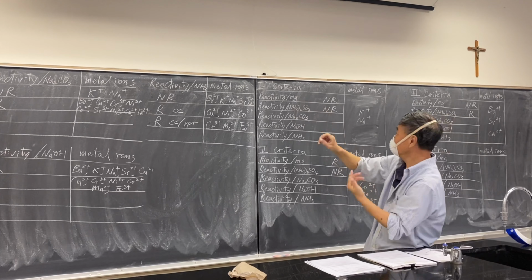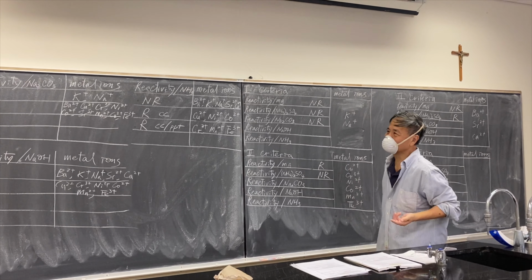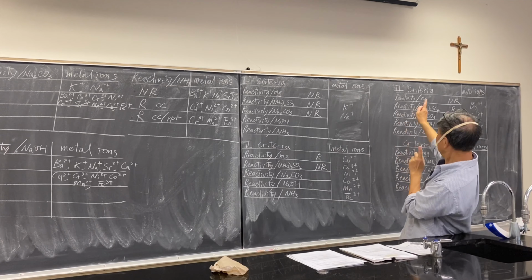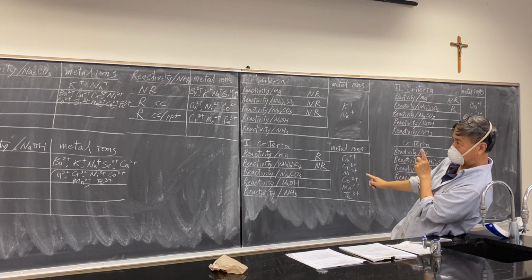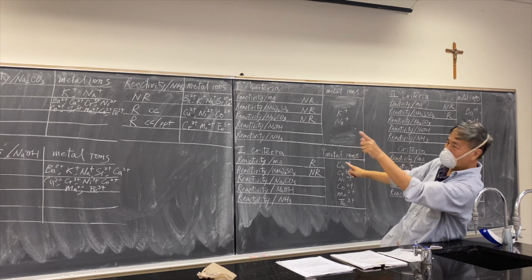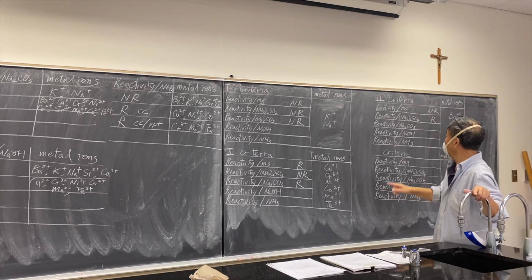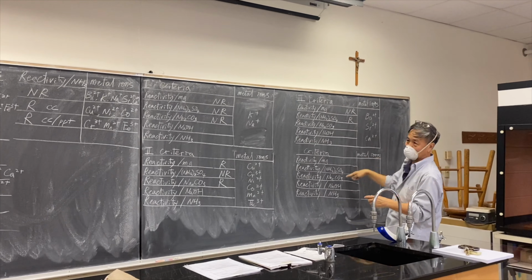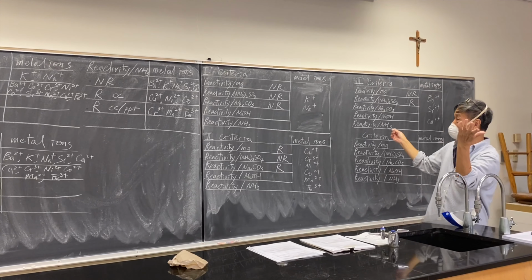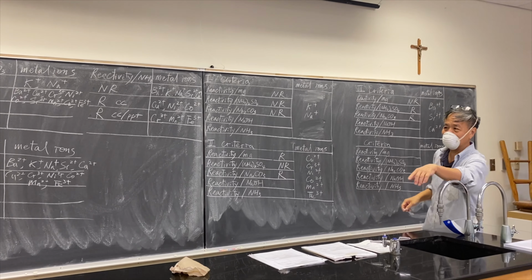Are those no reaction? Yes, it says so. No reaction. So beautiful. And then 1, 2, 3, 4, 5, 6 of the second table. What are they? They all react. How about those three? 1, 2, 3. Well, based on our previous work, they all have a reaction. Then you have to say they all have a reaction.